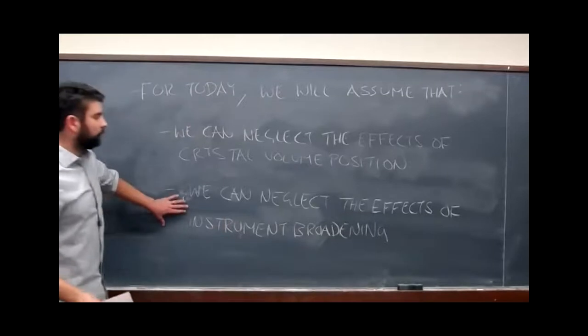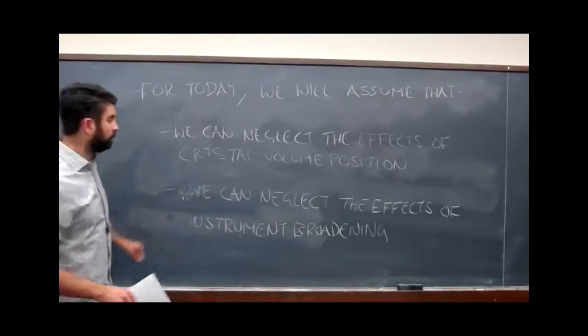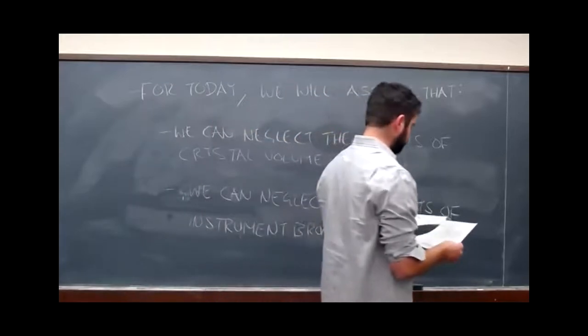Basically, this means we're not going to worry about how the instrument can sometimes make our diffraction peaks larger. We want to talk about the effects of material on diffraction peaks.